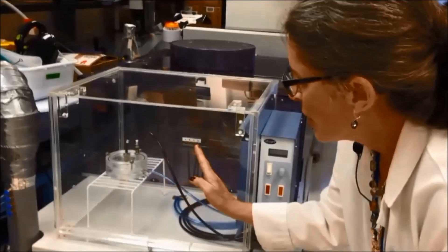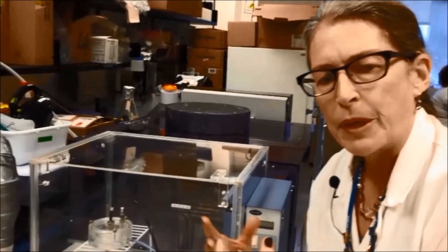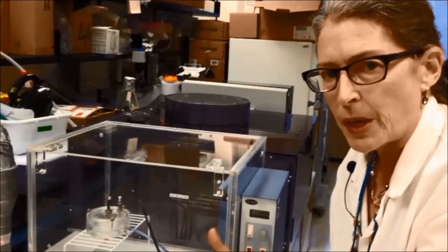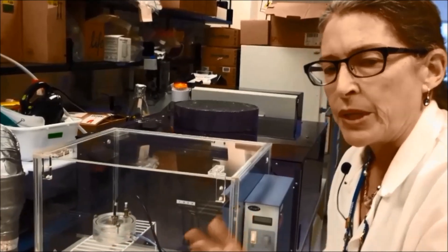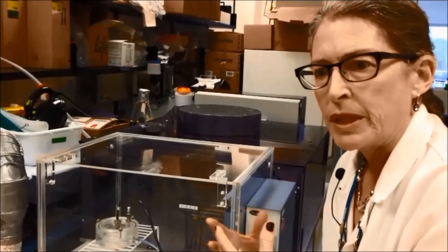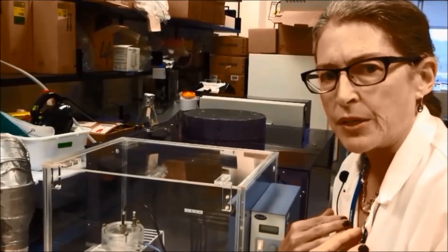The cells are in this canister. The smoke is going into the canister, so not only the gas but the particulate matter from the cigarette is going to be deposited on the cells, which have no medium on the top but medium on the bottom. That way they're exposed to the whole plethora of things that would normally be exposed to your cells in your lung.